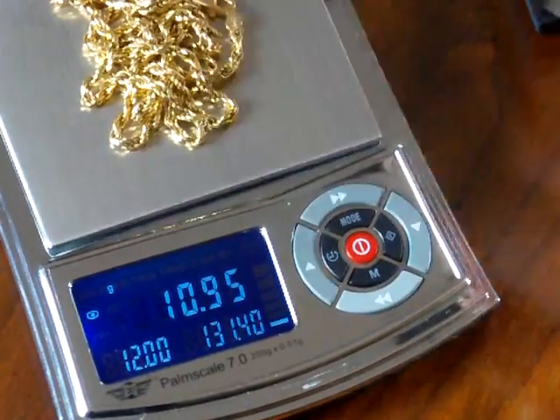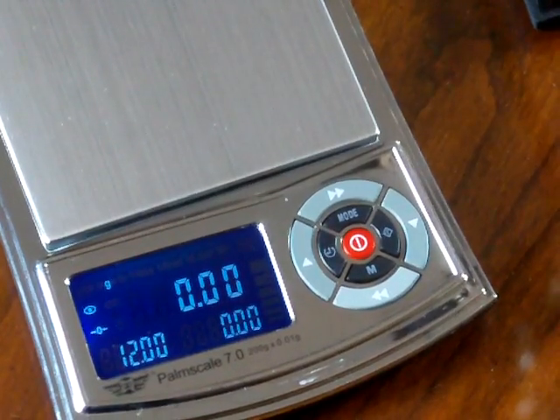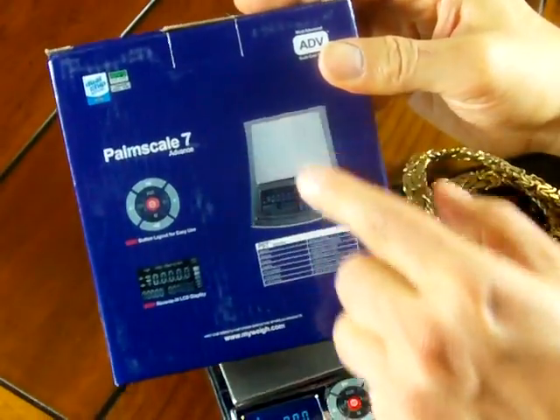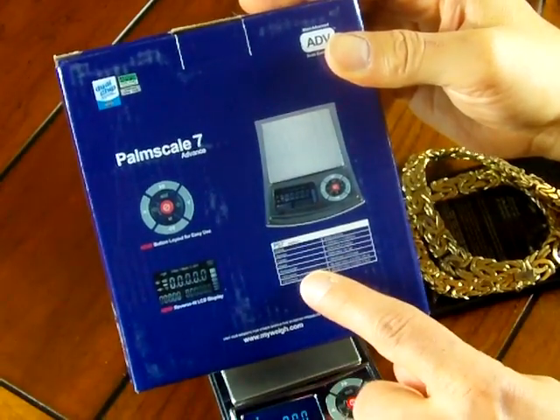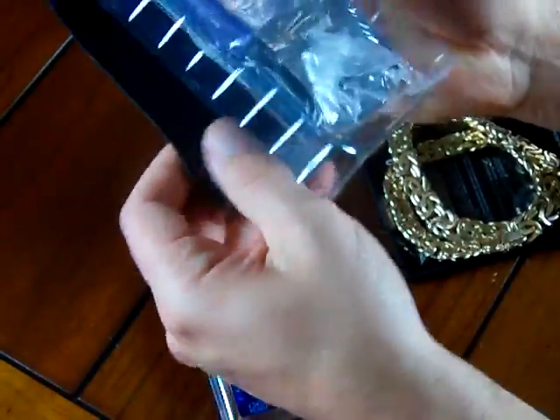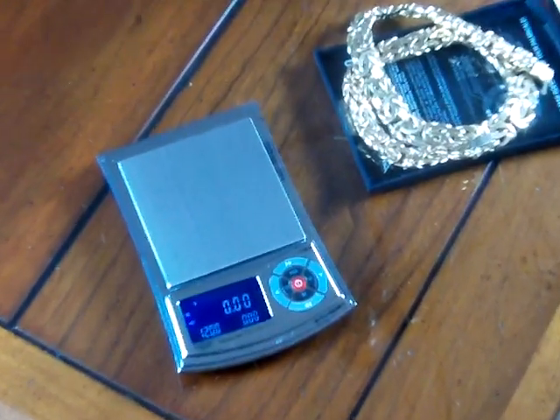This is a great scale for the money. Let me cover calibration and the weigh meter. The scale comes packaged in a nice box — MyWay does a spectacular job in packaging. The box says PS7 Advanced, 200 grams by a hundredth of a gram, with weigh meter technology. The back of the box shows the scale overview, the control keypad, the display, and fine print showing all the units. When you open the box you get your scale, a 200 gram calibration weight, and a little pouch that the scale can fit in. MyWay gives you everything you need to operate this scale.